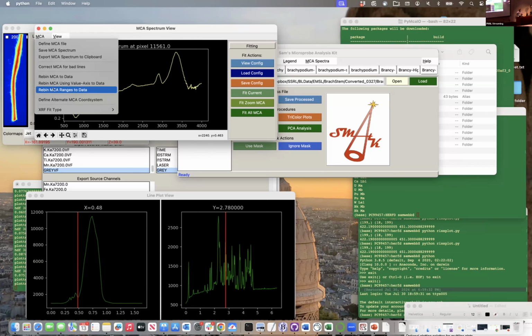I did this with both the infrared and the mass spec data yesterday just to get a rough channel, so I don't just see a big top channel and I can see the different bits. That's how I made that animated movie yesterday, by binning through every half mass to charge over a range and then animating a GIF with all those images. That's going to become a file option soon, to make me a cool looking GIF for my presentation. That's going to be in the next version.